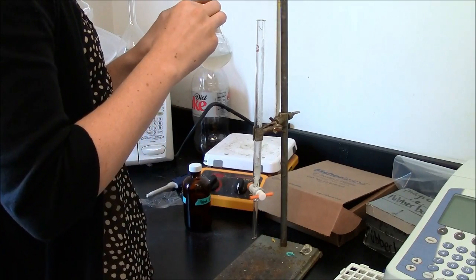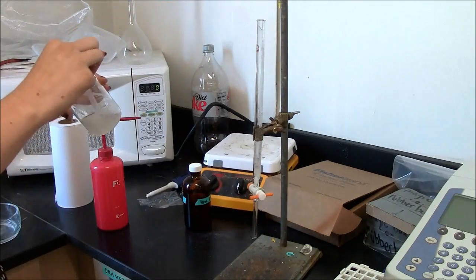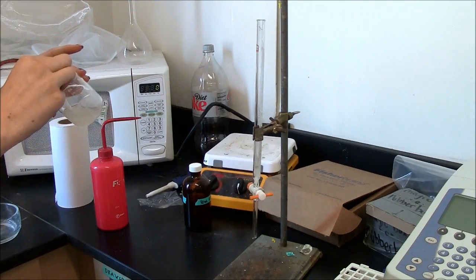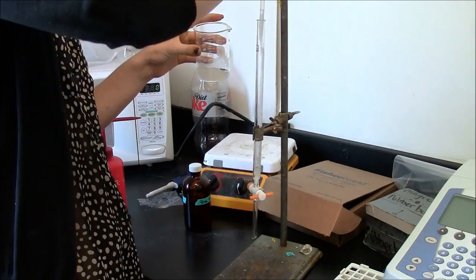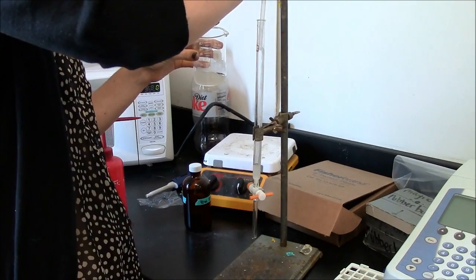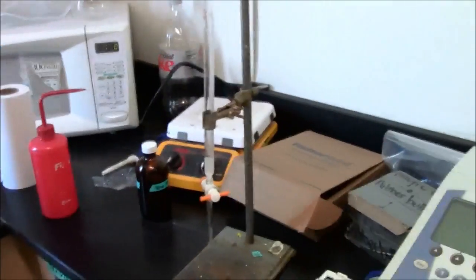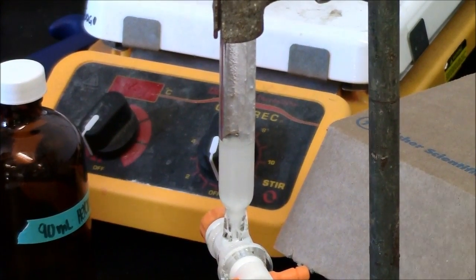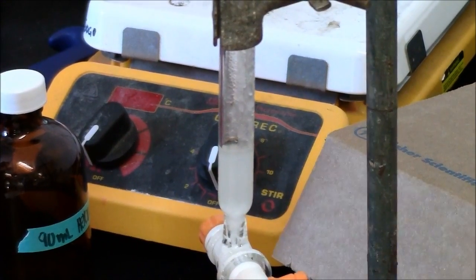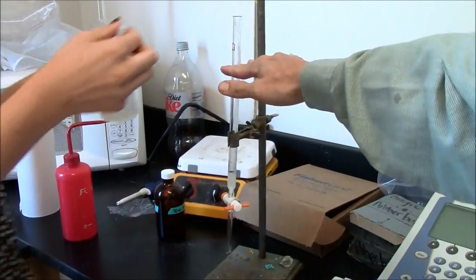Alright, so that you can see the possibility of trapping air there. So a little more fluid, a little more fluidity will help. Okay, I think that looks pretty good. Let's see what that looks like. Yeah, that looks about right. Okay. I put that much in. Yeah, you're going to fill it up to about here.